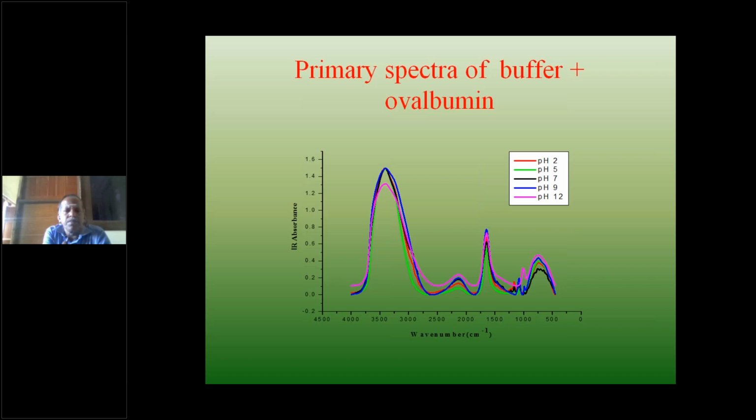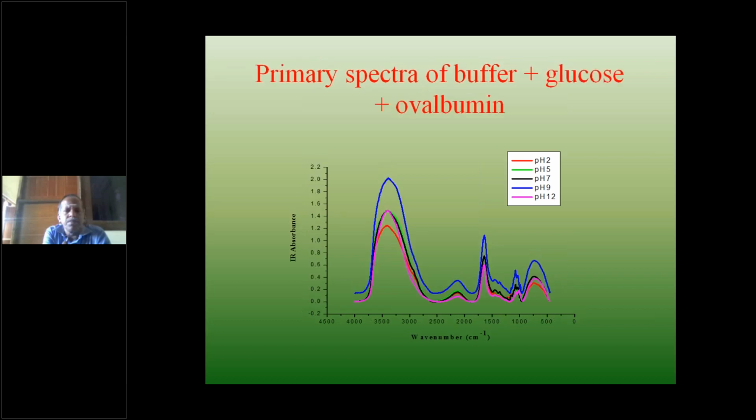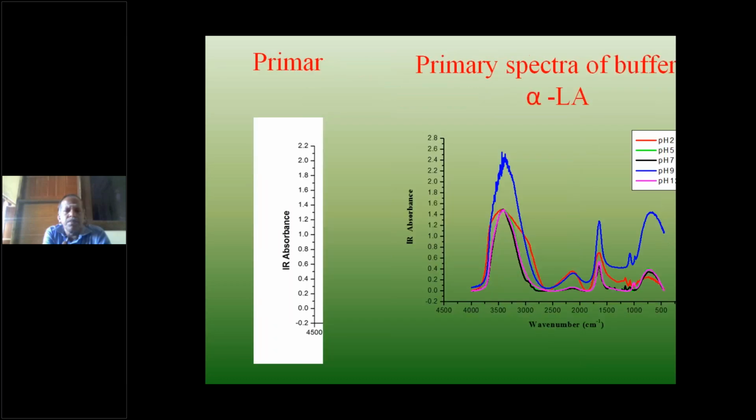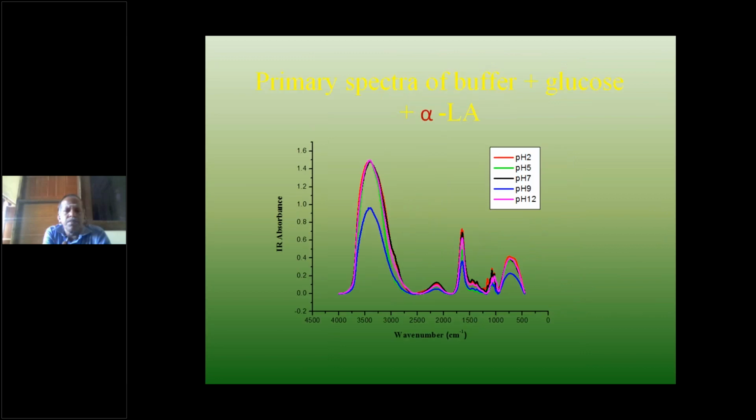The data available between 1600 and 1700 has been taken as an input in the Origin program, and the second derivative analysis is made using the least square method. The second derivative spectra has been constructed. See the second derivative spectra here.